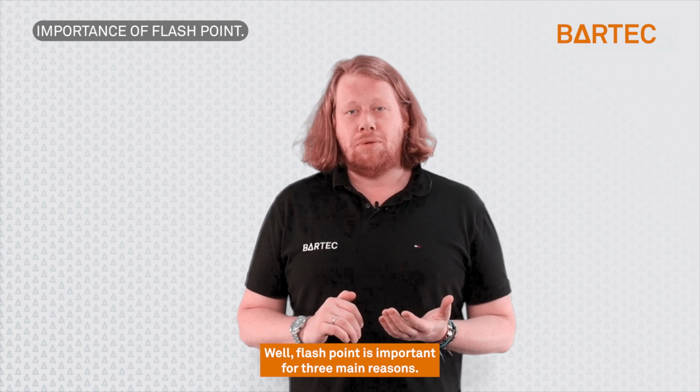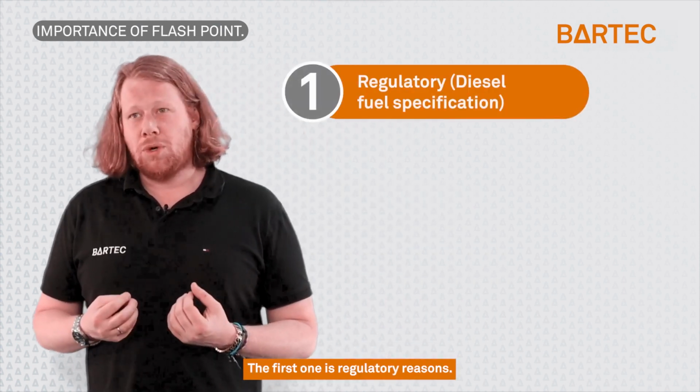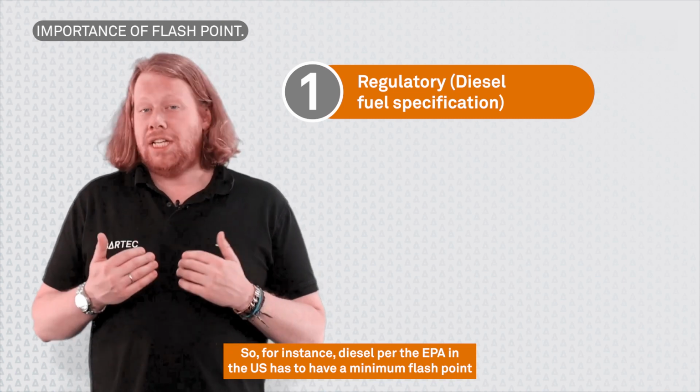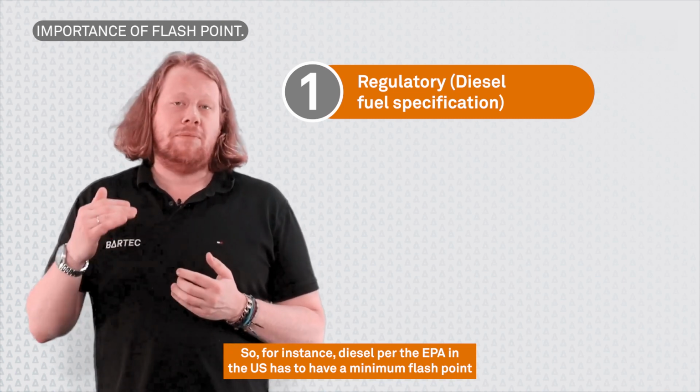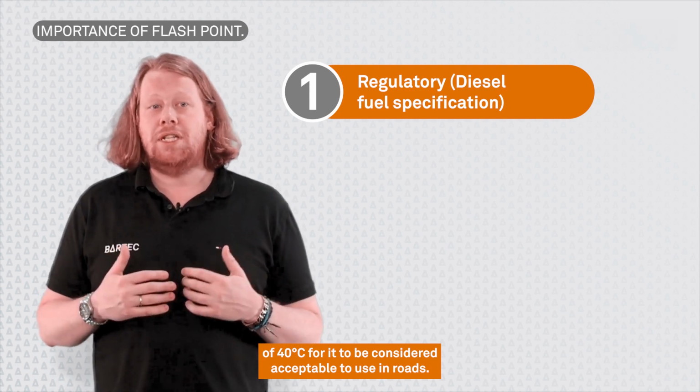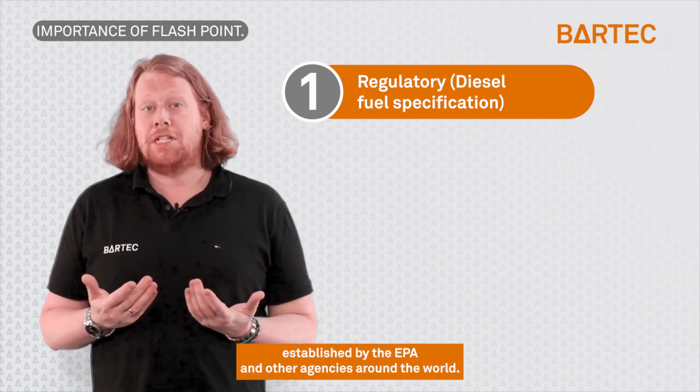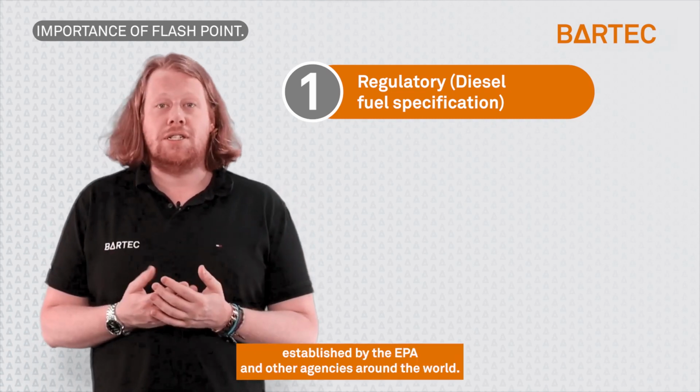So why is flashpoint important, you ask? Well, flashpoint is important for three main reasons. The first one is regulatory reasons. For instance, diesel, per the EPA in the US, has to have a minimum flashpoint of 40 Celsius for it to be considered acceptable to use on roads. Similarly, jet fuel and other fuels also have flashpoint requirements established by the EPA and other agencies around the world.